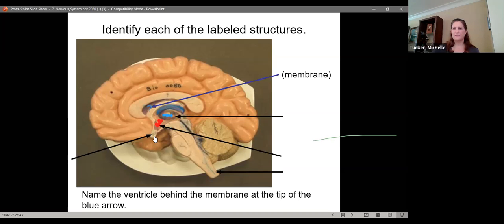It's kind of an odd presentation. We wouldn't present it this way. We'd present it more with the pink peanut model, where it's hanging off, it looks like a pink peanut. And then go ahead and put an X on the spinal cord. Yeah, so this one's probably not my favorite, but okay.